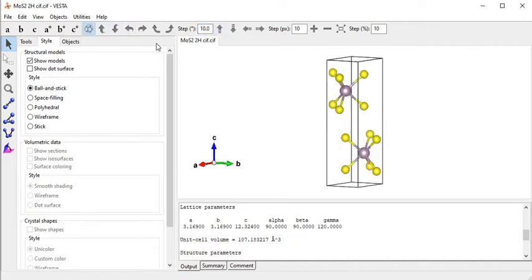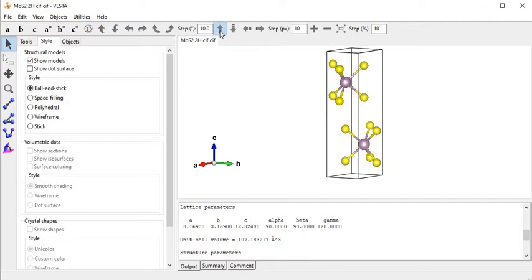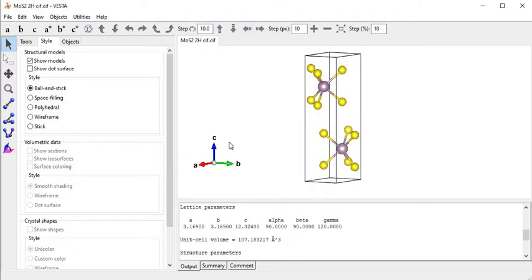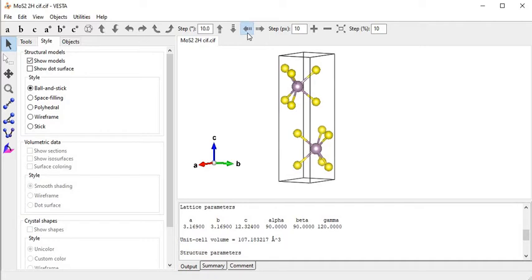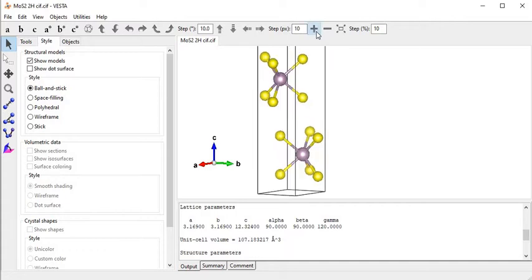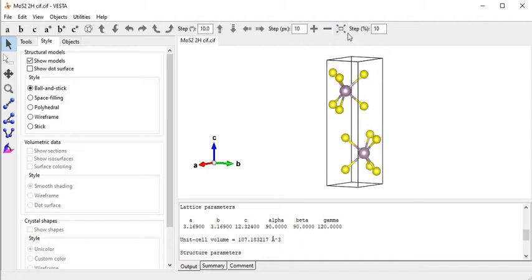This is the translator of the crystal view - just upward, just downward, to the left side. If you want to see this image somewhere or need to close it, I click on the left and right arrows. This is again the step control for that. This is for zoom in and this is zoom out, and this is the step control for how much it will zoom in or zoom out.